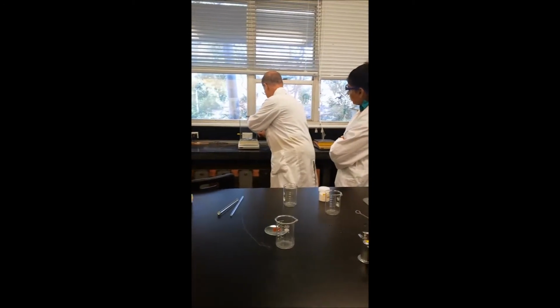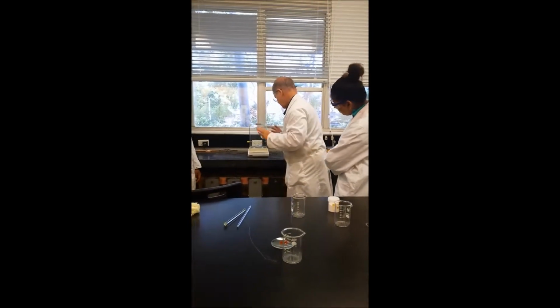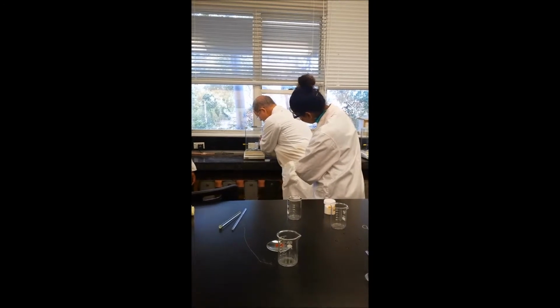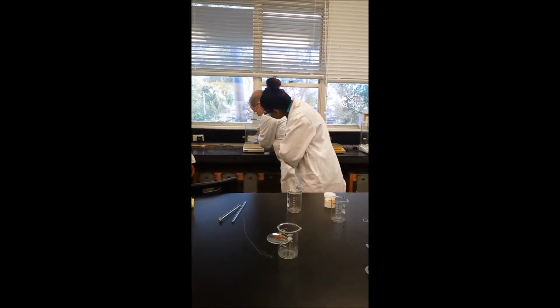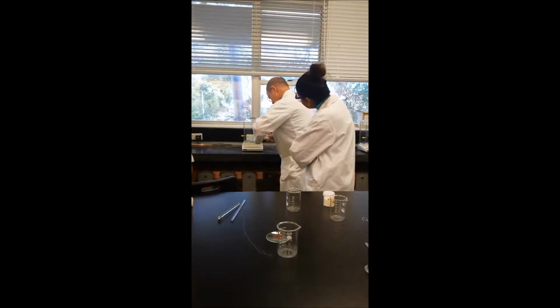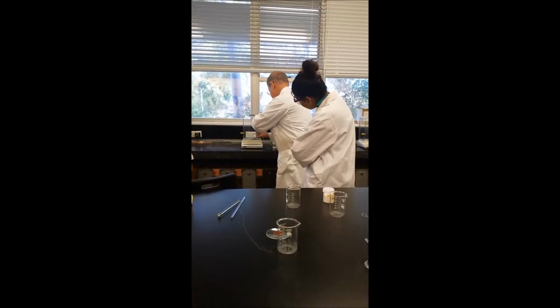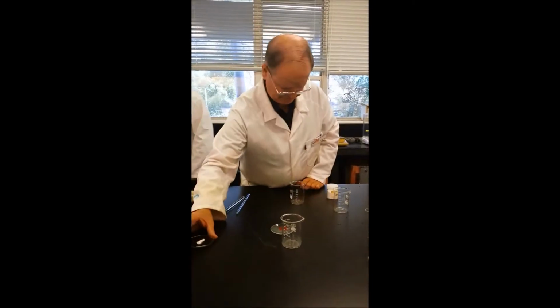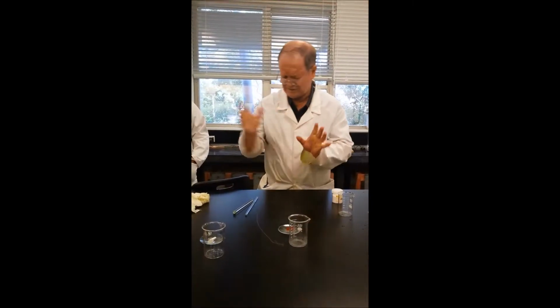Okay, I better make sure I zero this. Press the tare button, and it zeros. Now I'm going to do the same thing. I'm going to go 0.1 gram. That's it. That's not bad, that one. Pretty close. Okay, close the door. Open it up, and it's best to close the door when you're finished. Well, it's obvious which one's which, anyway.